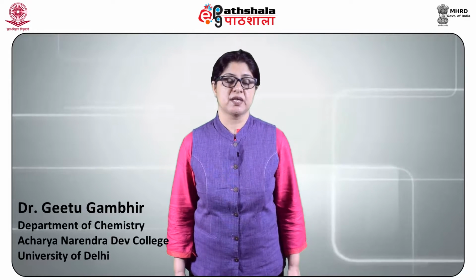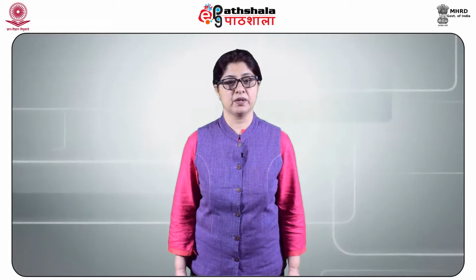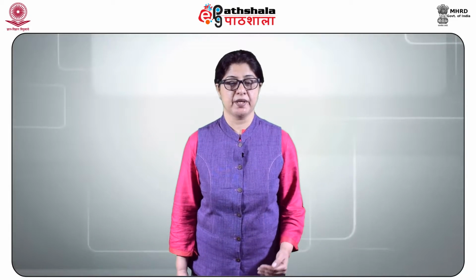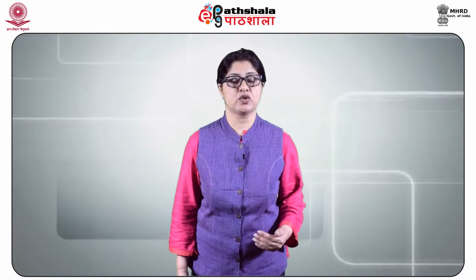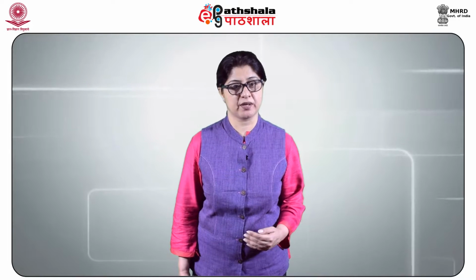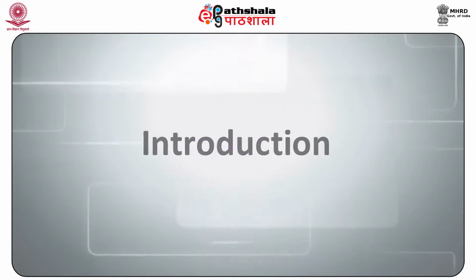Dear students, after studying this module, you shall be able to know about gas chromatography, advantages of gas chromatography, principle and instrumentation required for gas chromatography, and finally the applications of this chromatography.